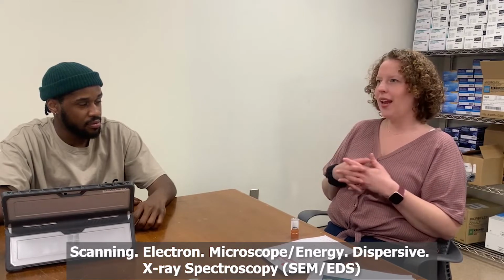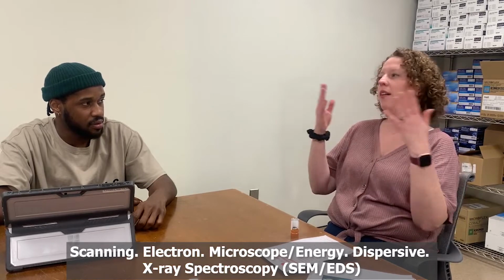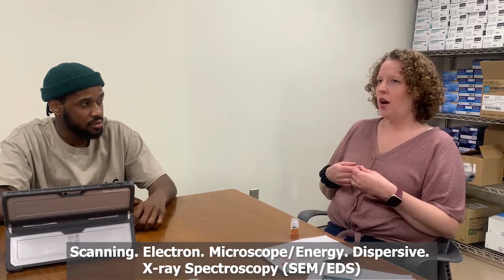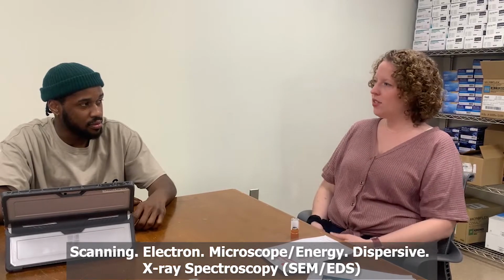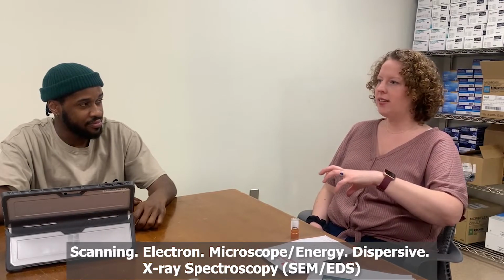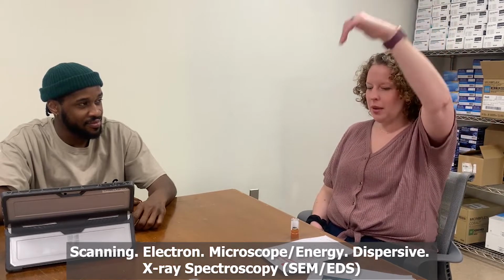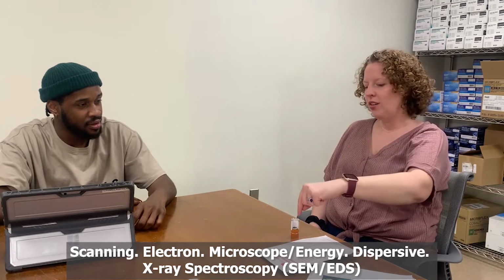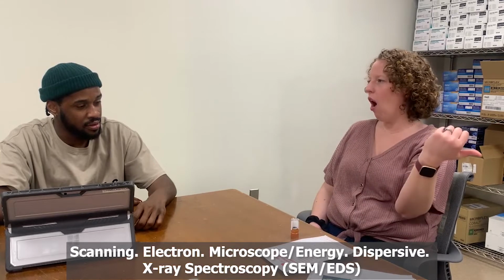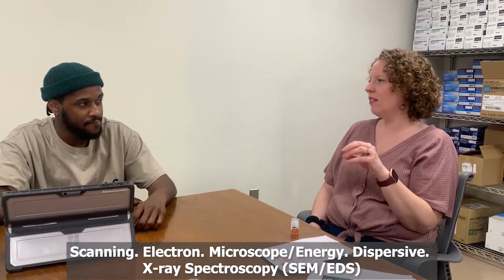A normal microscope can get to maybe 400 times, but the scanning electron microscope can get much larger, 100,000 times. So once we get a picture of the particle, we then use what's called an EDS, or Energy Dispersive X-ray system, and it analyzes the X-rays that are coming off that sample. So you're sending an electron beam onto the stub, and that electron beam is interacting with your sample, and there are actually X-rays jumping off the sample.